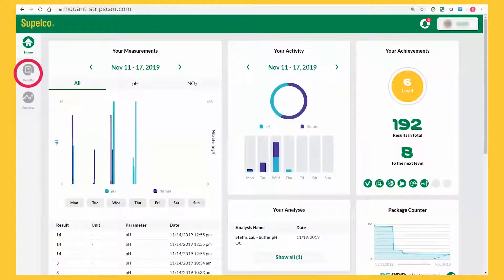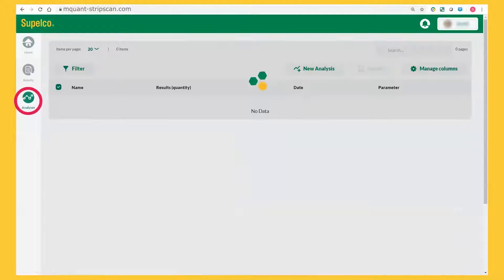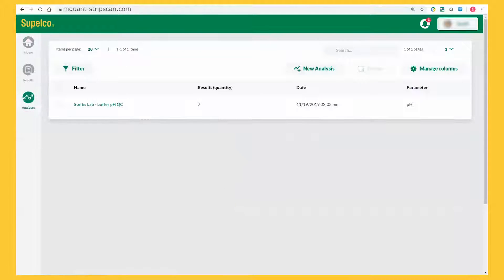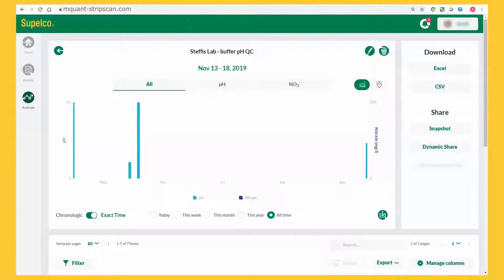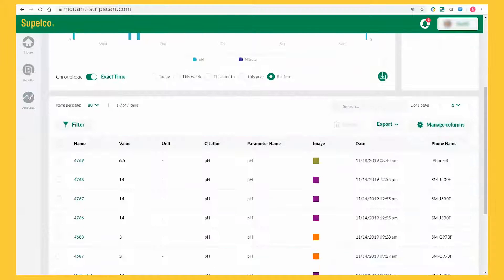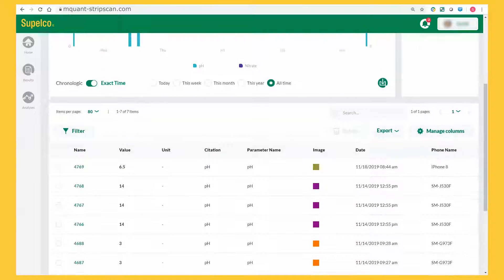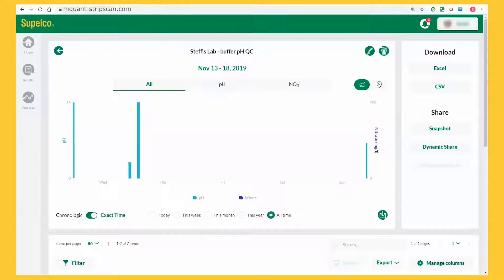You can view and manage your results — for instance, by creating analyses from subsets of your measurements. You have a variety of options to display, graph, and compare your results.